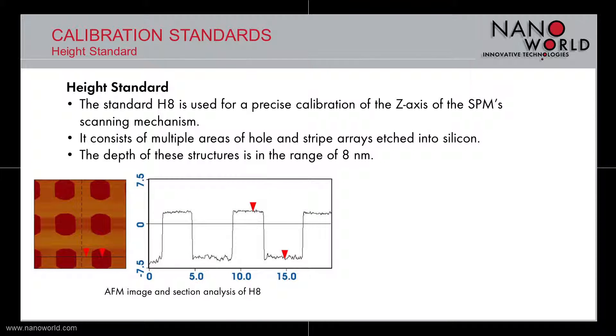On bottom left you can observe an AFM image of one pattern of the H8 calibration standard and on the right a corresponding section analysis. The measured vertical distance is 8.08 nm, which is very close to the expected 8 nm.